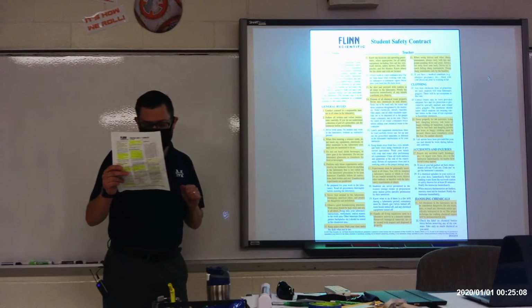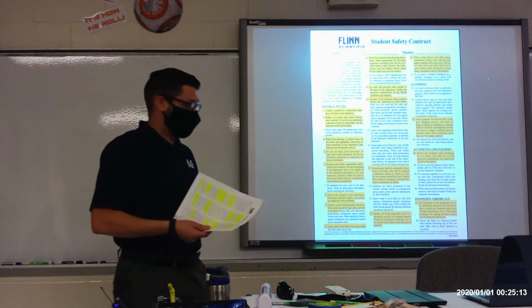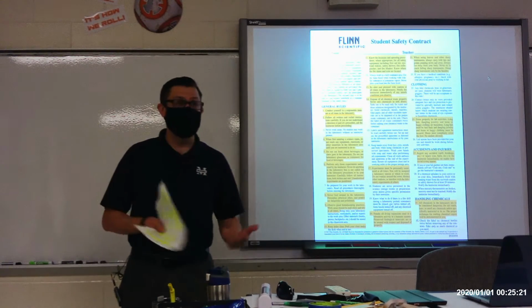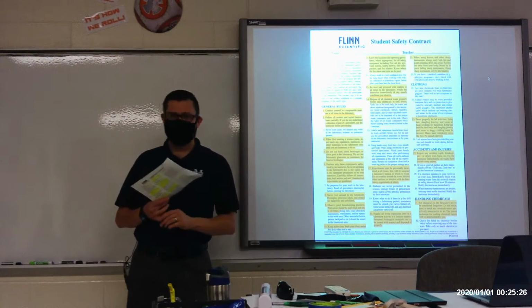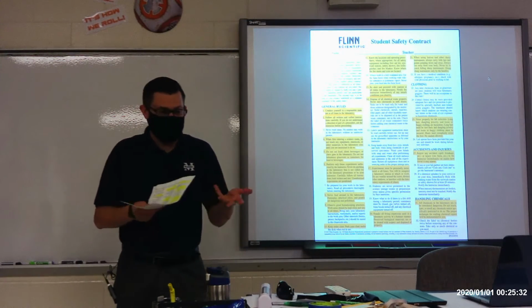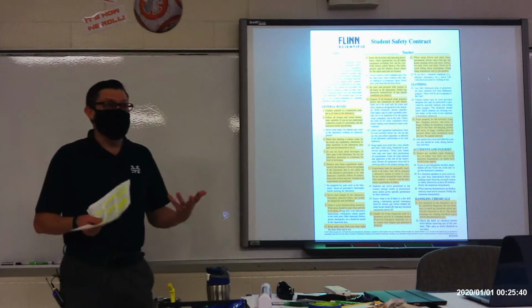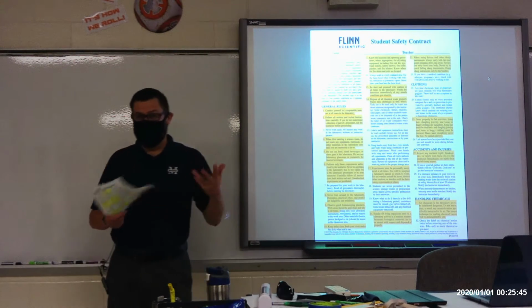Alrighty. Number 20, handle all living organisms in a laboratory activity in a humane manner. Okay, this is a biology class, so we are talking about life. And there are some activities that we will do where we have living things in here. Now it's not going to be anything too fancy. We might have some worms or mealworms or something like that. But if we are dealing with living things, then we need to treat those living things humanely. One of the things that I would hope you would get out of a biology class is a better appreciation for life. And a better appreciation of life would mean that you treat living things kindly.